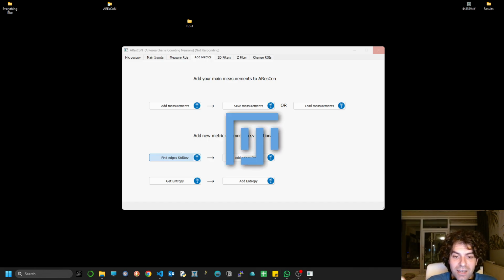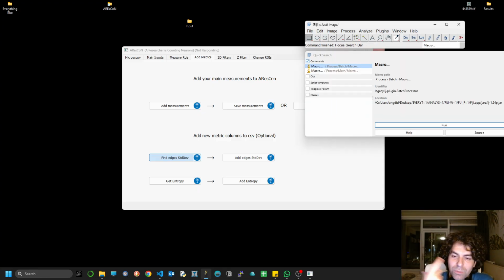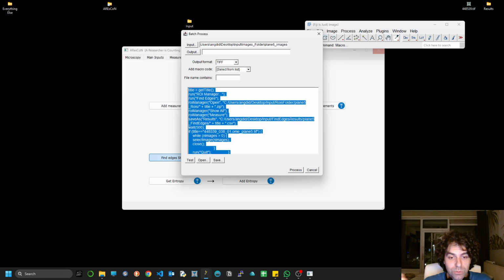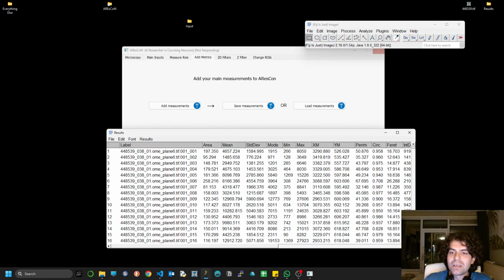That's why I ask you to take your hands off your mouse and keyboard as long as this is running. It's the safest way to go. PyAutoGUI is sometimes a bit problematic in terms of activating the images and clicking properly. I've done a lot of workarounds to make sure that it works successfully.